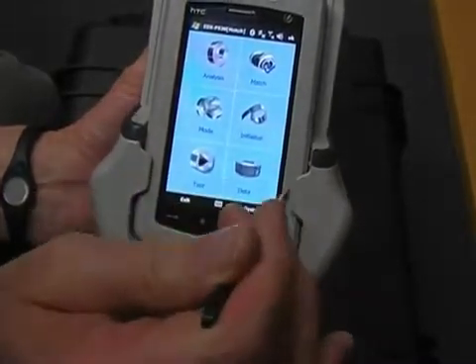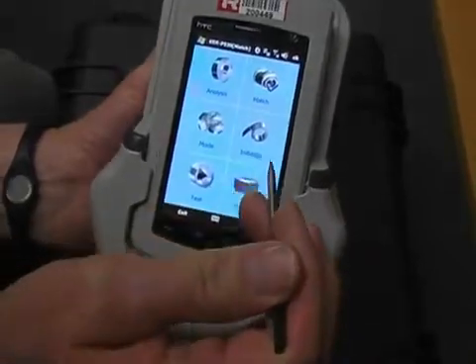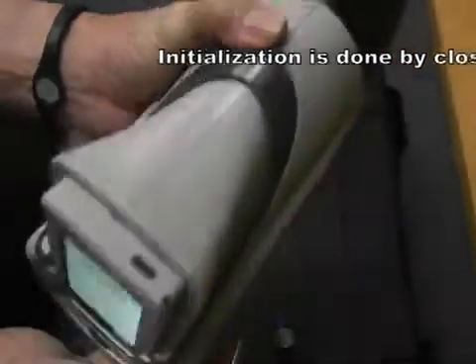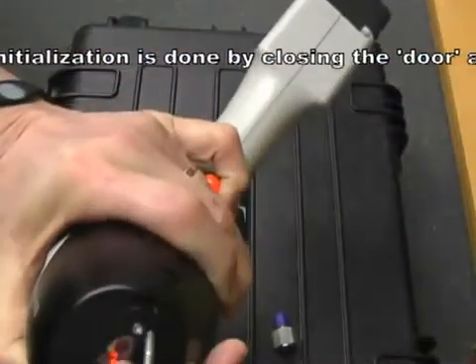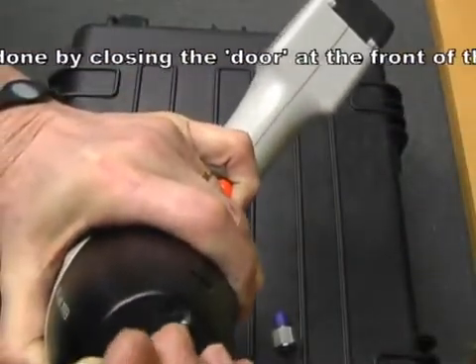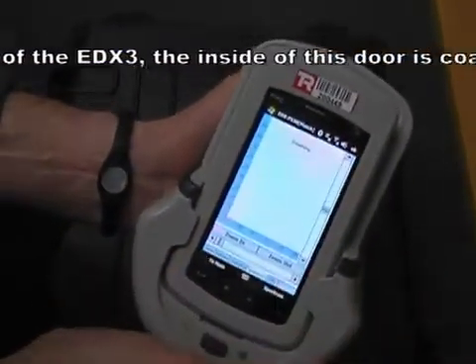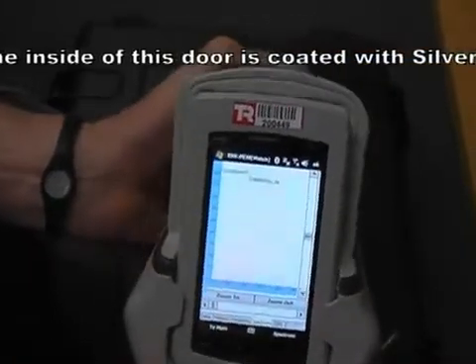Now, if we haven't done it for a while we'll need to initialise. I'll show you how to initialise when we hit the initialise button. We have to close the window here. Window's closed.